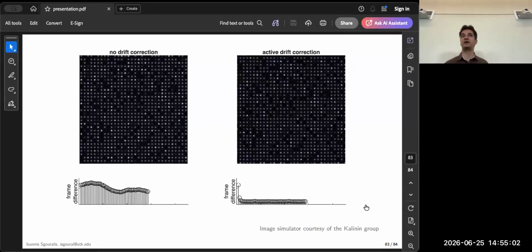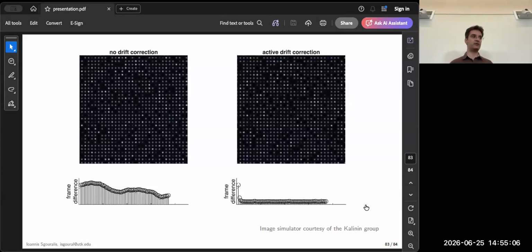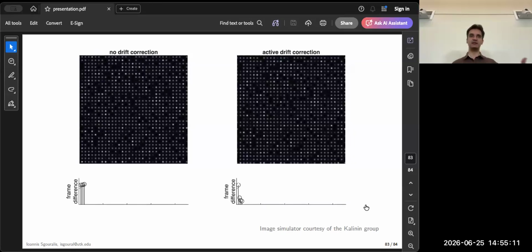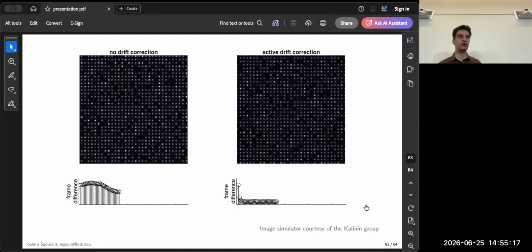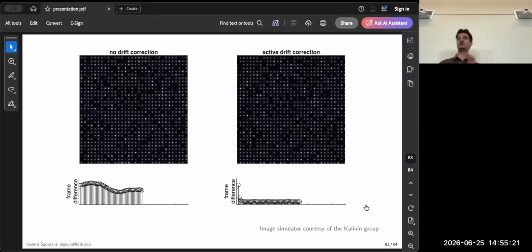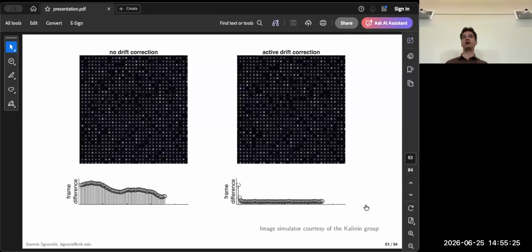That is another very important question, very interesting question. To repeat it for the audience online, the question is what would happen if the specimen changes across frames, either because we have degradation or because we actually manipulate the specimen to change. The short answer is, as long as the changes are pretty localized to a small number of pixels in the entire field of view, the method could be applied.